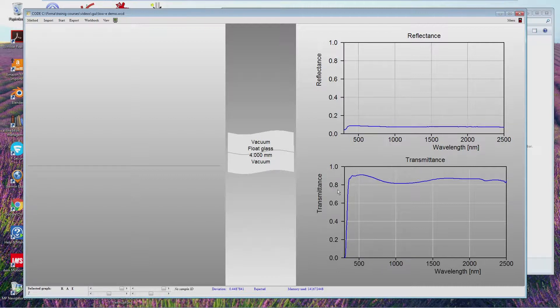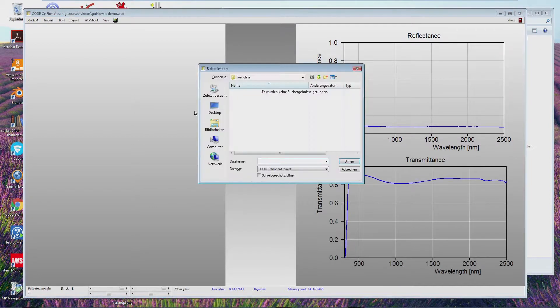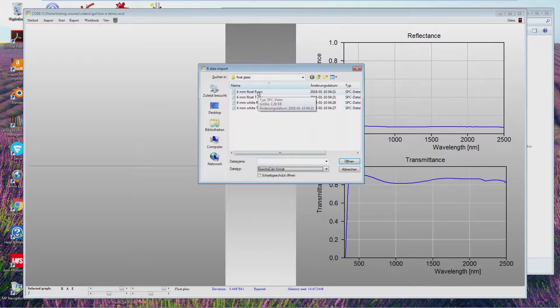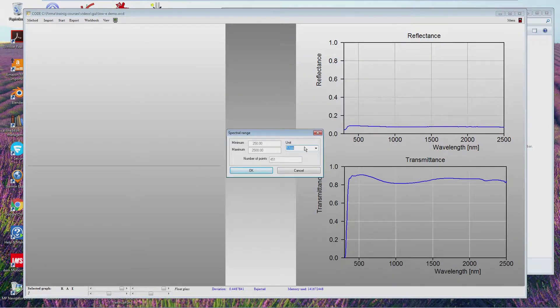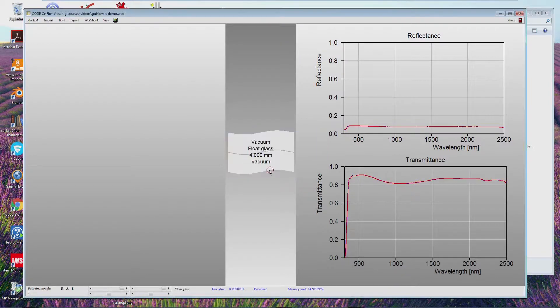With F7, we see the simulated spectra, and we can verify that we really reproduce the measured data. I can import the measured spectra that we used — I use the import command here. Let's call this 'sample float glass' and import the reflectance in spectra calc format. The unit here is nanometers — it's important to check that. We also import the transmission spectrum belonging to this sample. And here you can see that we almost perfectly reproduce the measured red curves with our blue simulation. So that's perfect.